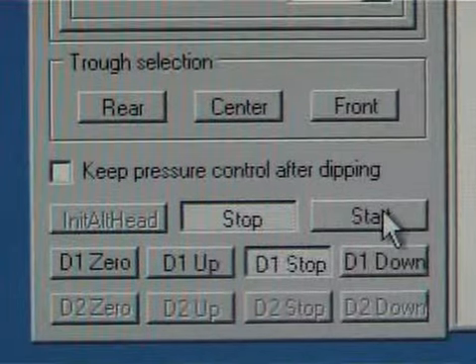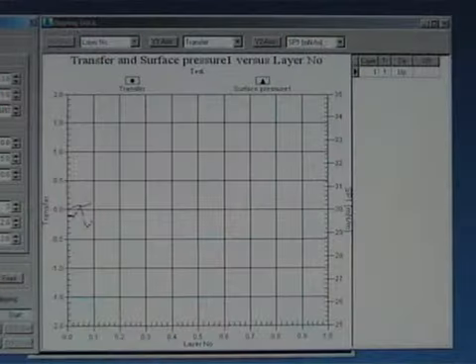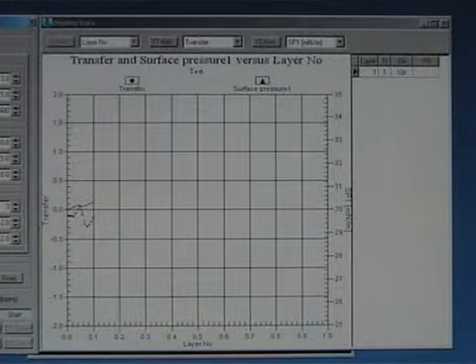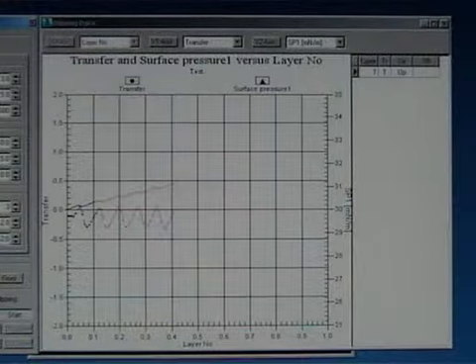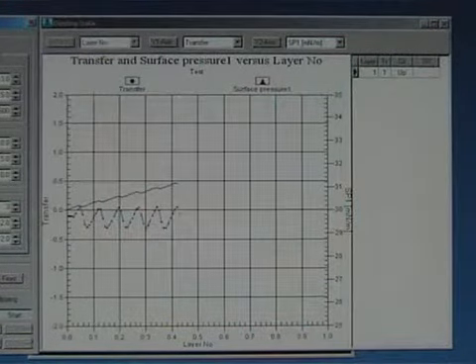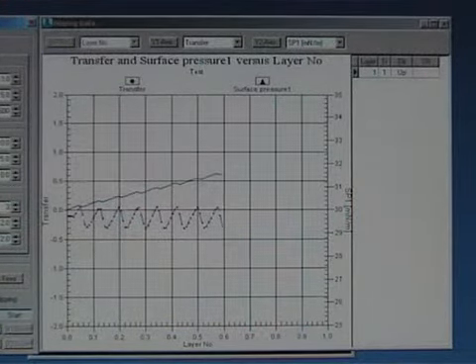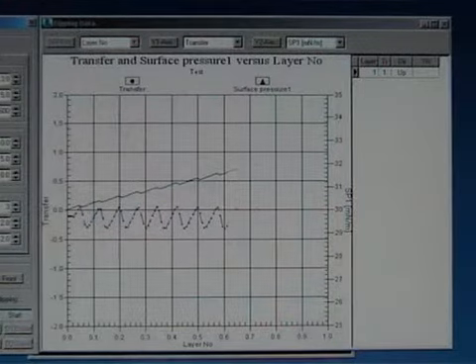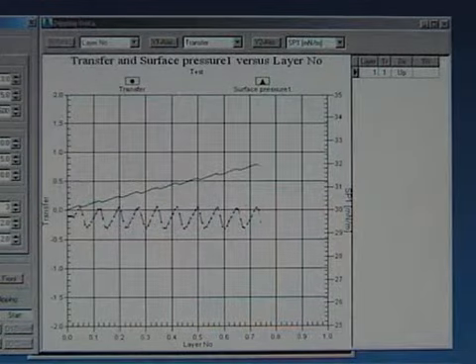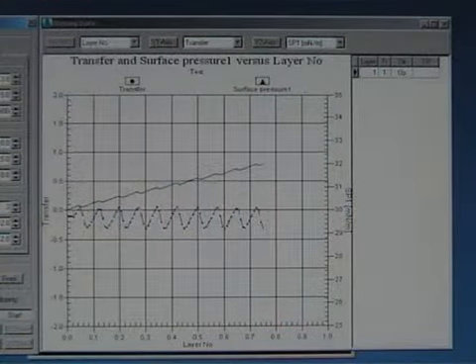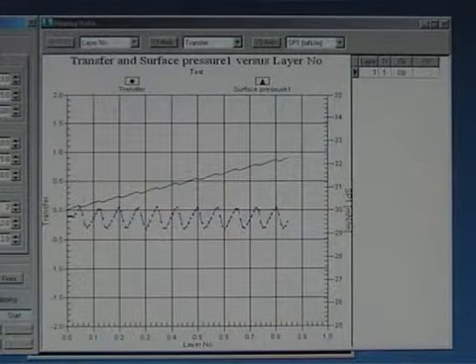Once all the settings are ready, press the start button to start the dipping. The surface pressure is shown with a blue line in the graph and the current transfer rate is drawn with a green line. Usually the barriers oscillate a bit during the dipping and this causes a minor oscillation to the surface pressure.